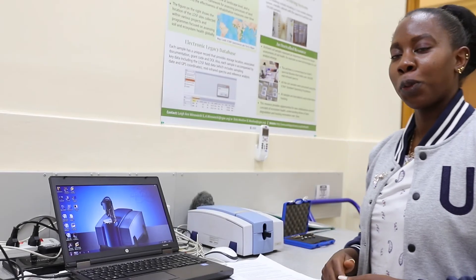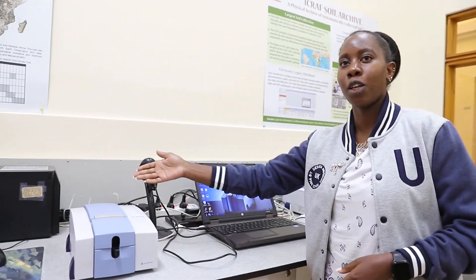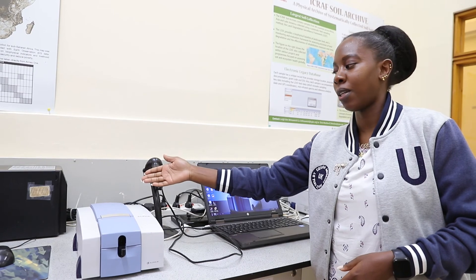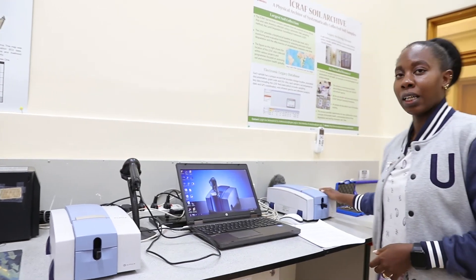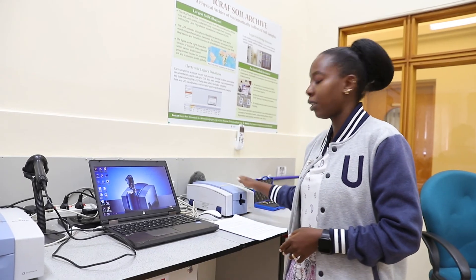When you want to power off the instrument, you go to the Opus software and shut it down. Then you go to the UPS and shut it down, which will automatically shut down the Alpha instrument. This is important to maintain a high signal-to-noise ratio when operating the instrument.